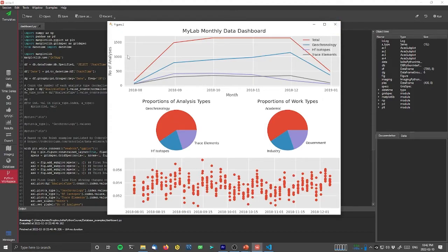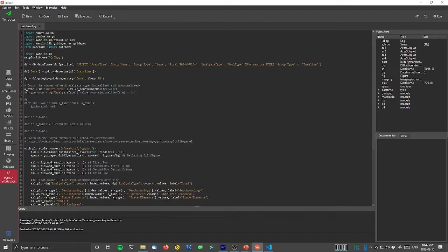The first thing we'll see is that there are 3 rows in our figure, and we actually have 2 columns in our figure. It's just that the first figure here takes up both columns, and in the third row it takes up both columns as well. You might notice that it's a slightly different style than the default matplotlib plot. That's because we're using this Seaborn ggplot approach. So let's have a look at the code.